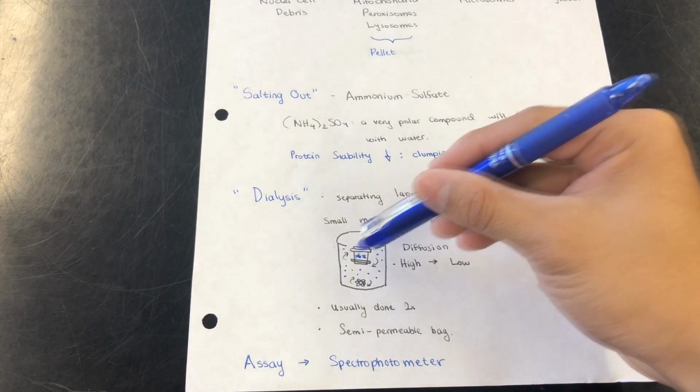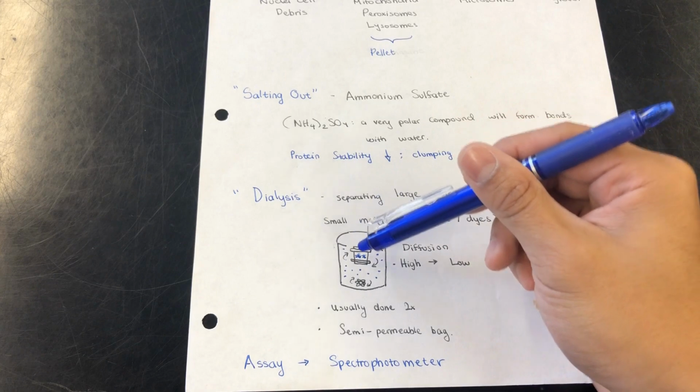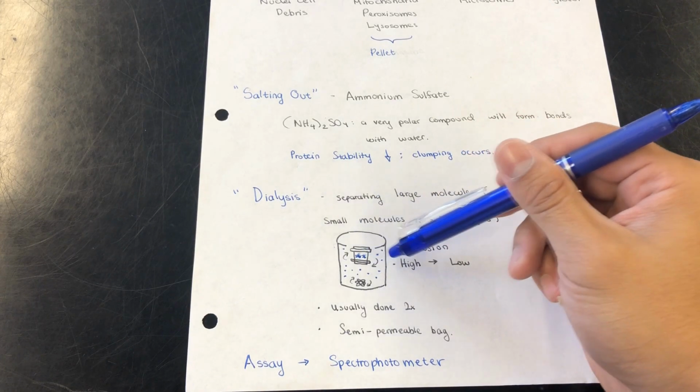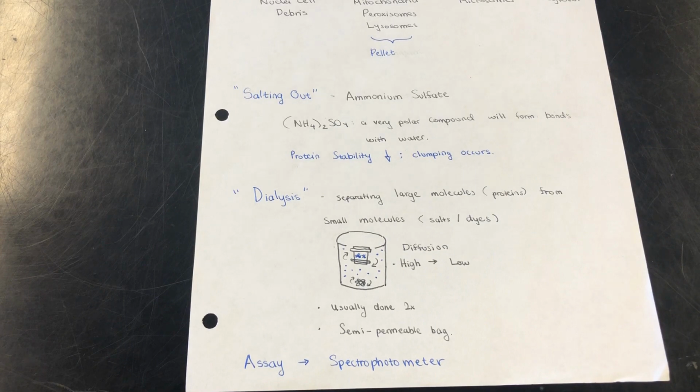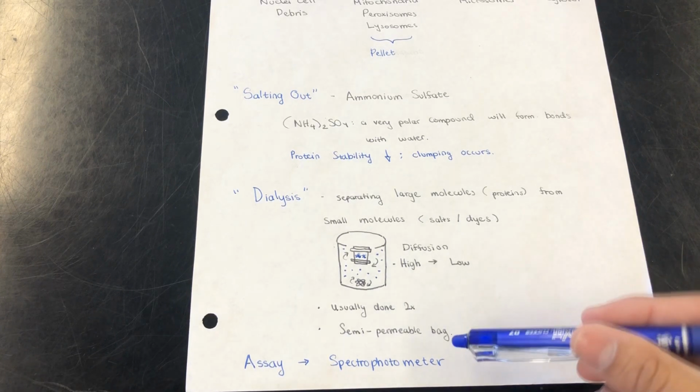When you spin it, diffusion from high concentration inside seeps out to low concentration. And because it's a semi-permeable bag based on size, only the small molecules will leave, allowing some type of purification for your enzyme. Usually done twice.